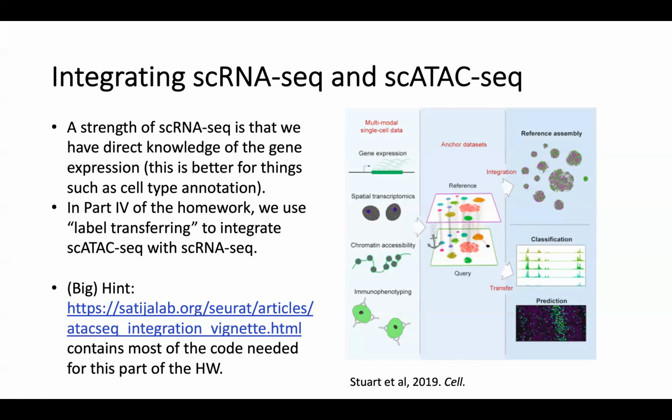So basically, from the single cell ATAC-seq, you can predict which genes are likely to be expressed. MAESTRO builds a model where, if there are a lot of open chromatin regions right around the transcription start site, then it's likely that this gene is expressed. So you have some information about gene expression from the single cell ATAC-seq, and MAESTRO infers a score for each gene.